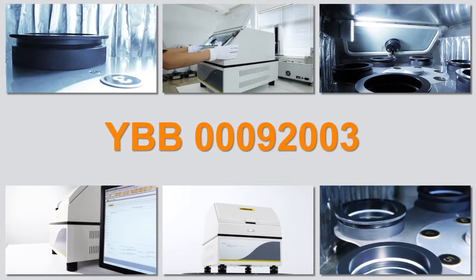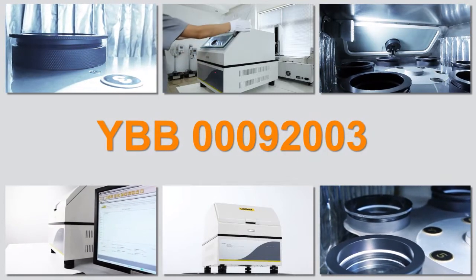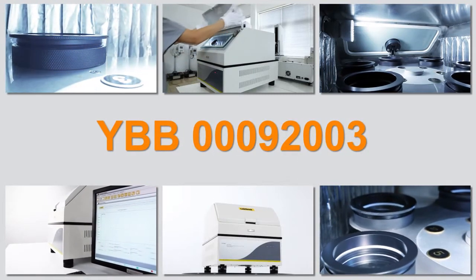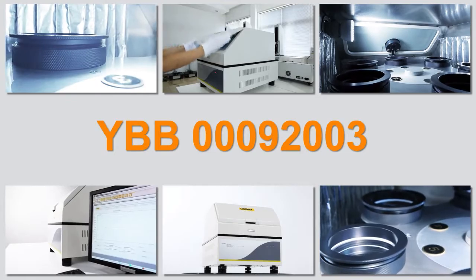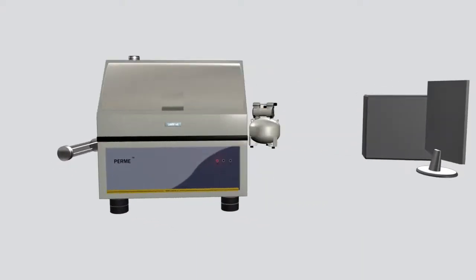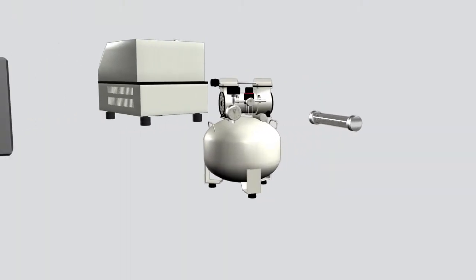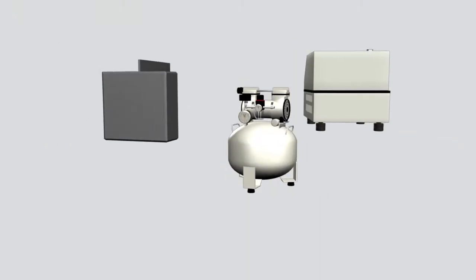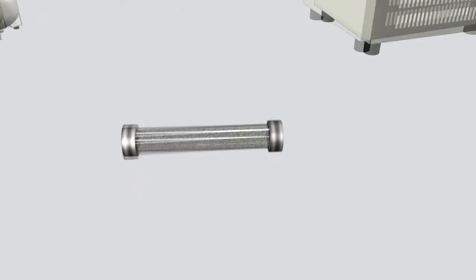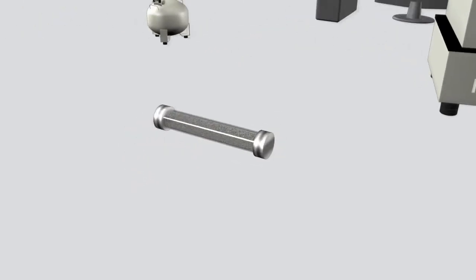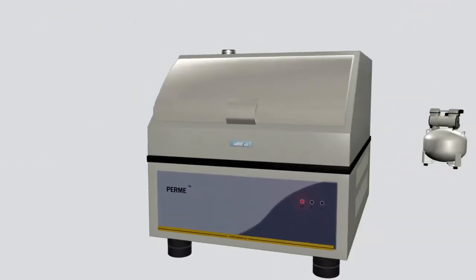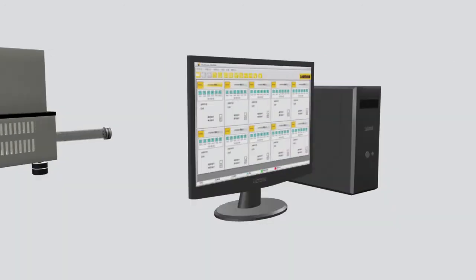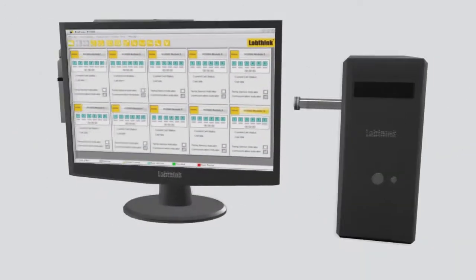The entire testing system consists of an air compressor, an air drying and filtering device, the WVTR testing system, a computer and the testing software.